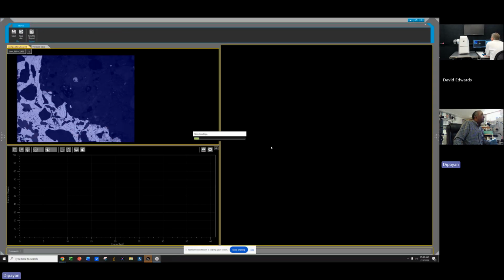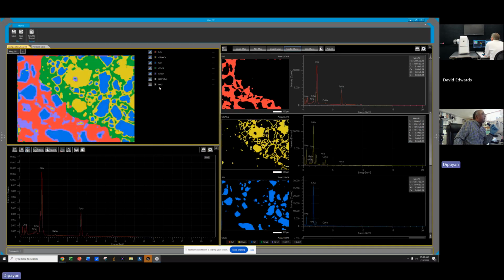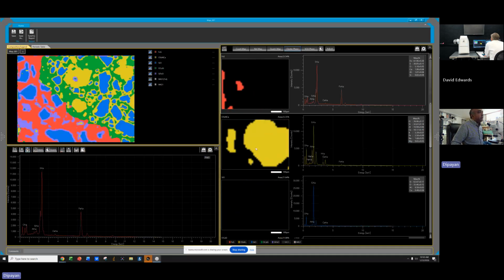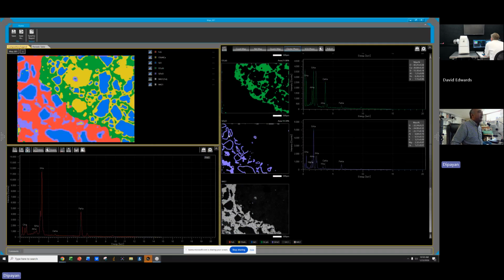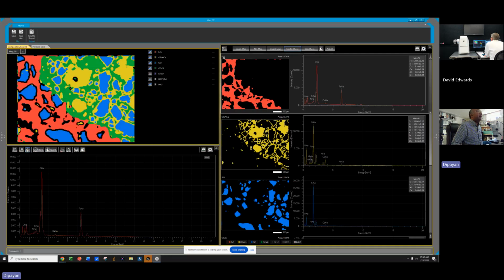Yep. And this is where I play with those buttons. So now let me show you. In the cluster phase, I close this to get the color back like that. I can turn on IMG1, but IMG1 first literally makes it darker. So for this simple exercise, we knew my pyrrhotite is iron and sulfur. So this is my pyrrhotite. I don't need this boundary, I just get rid of it. This is my pyrrhotite, so this is where I rename it.